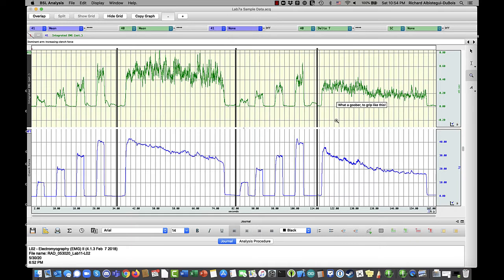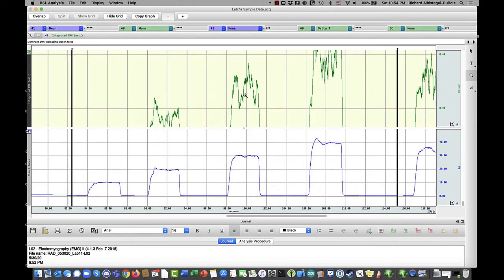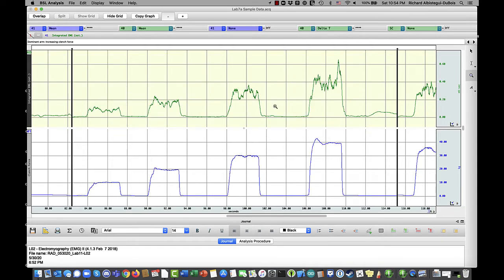Now, probably the most difficult thing you might want to do is to zoom in on a particular area, say I want to zoom in on this. Let's zoom in there, and then say, but I want the vertical scale to show me everything just at this time scale. One very useful thing you can do in here is to right-click and say Auto Scale. So if I told it auto scale single waveform, what it's going to do is change the y-axis on this one to make it so that I can see all the data. It's similar to the show all data, except only doing for the vertical axis.